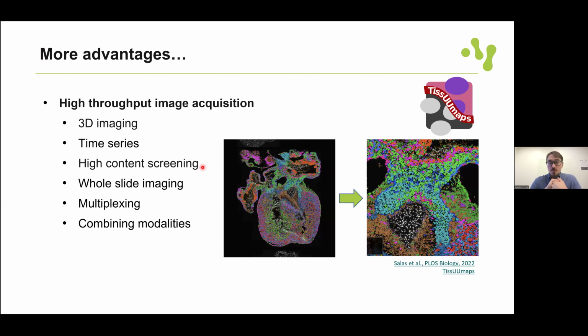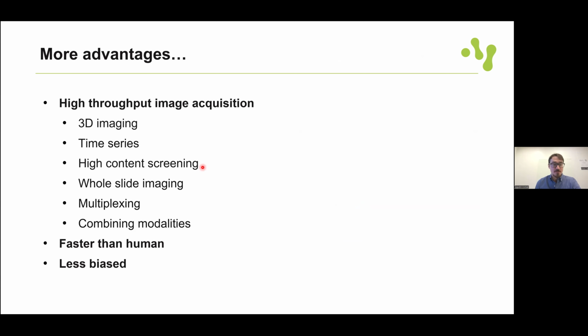And we could also combine different modalities. We could combine the modalities I mentioned before. We can go into spatial transcriptomics, for example, and then we would like to detect the position of RNA transcripts within our sample. We generate tons of data very easily.